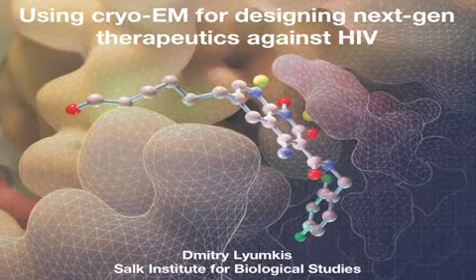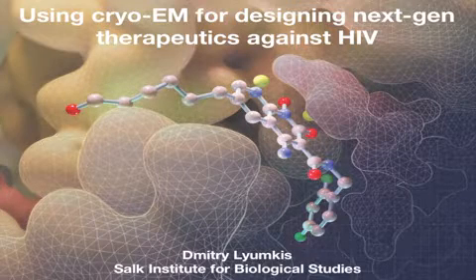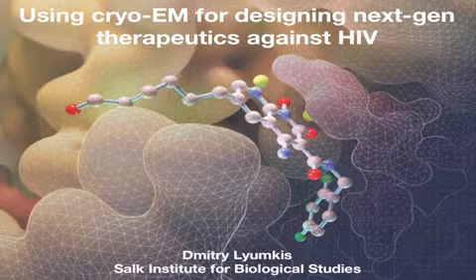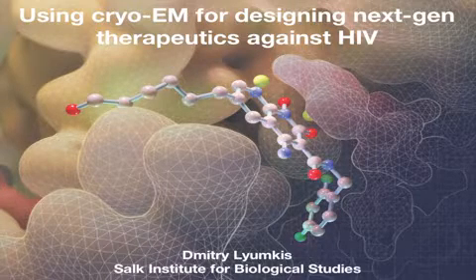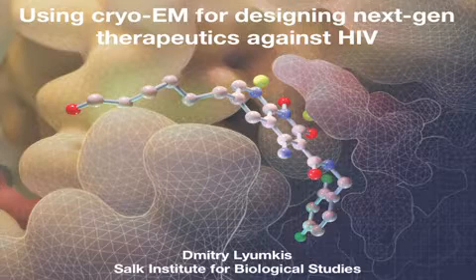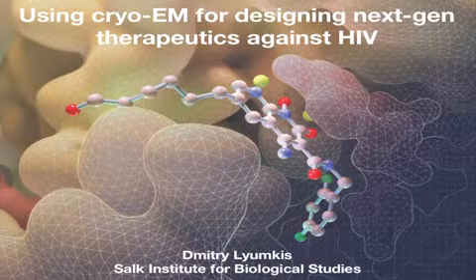So the work that I'm going to tell you about today has to do with our interest in developing next-gen therapeutics targeting HIV integration. This particular biological process, the integration of the viral genome into target host cells, has been of interest to the lab for some time now, and we've described some of the structural biology of the nucleoprotein assemblies that perform this process. But this process is also targeted by some of the latest and really the best available antiretroviral therapeutics, and there's active chemical development in the area.